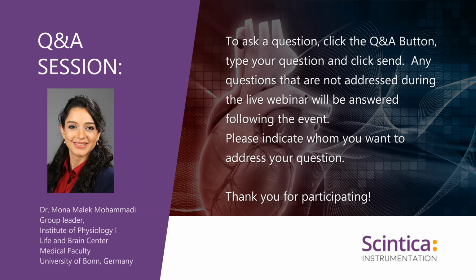Okay, interestingly enough, another question is asked, what is the combined expected mortality considering all the potential issues? So going back to the mortality of this surgery. If you take care of all the conditions and measures that you can to reduce cannibalism, and your mother is experienced and not young, I have reduced it to 0.